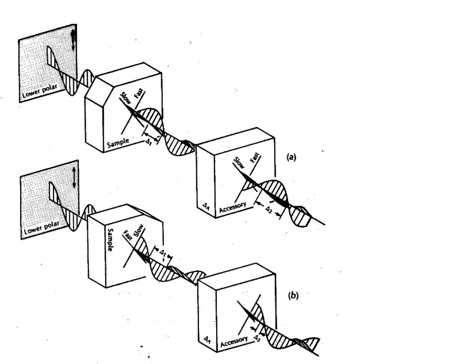More importantly, we know exactly what way it's oriented, so we know which direction is the fast ray in the plate and which direction is the slow ray, and it doesn't rotate when you turn the stage, it just stays in place. And the plates are labeled, and were deliberately mounted in the correct position. So this won't do any good if the mineral or the plate were oriented so that they were at extinction. So to make it useful, the plate is oriented 45 degrees from extinction to show as much of the interference color as possible. And if you want to compare it to an unknown mineral on your microscope stage, you orient that one the same way.